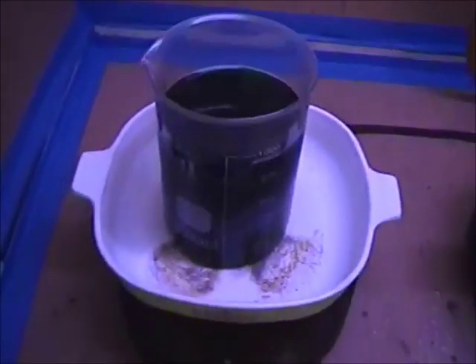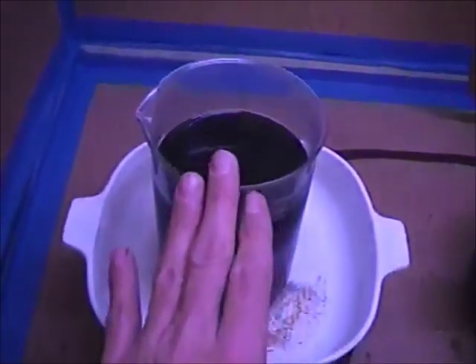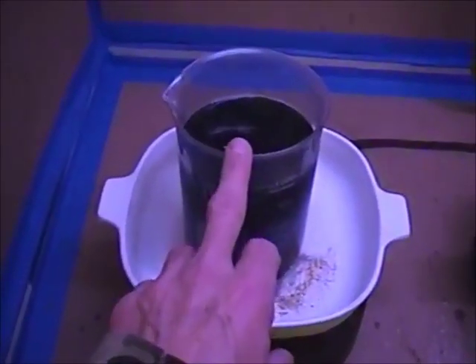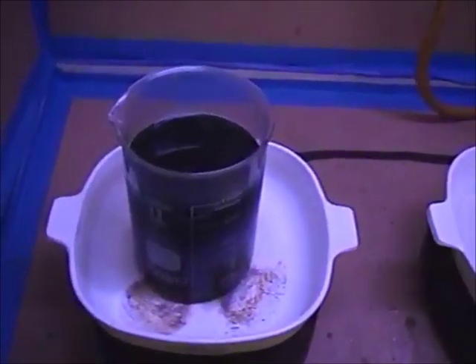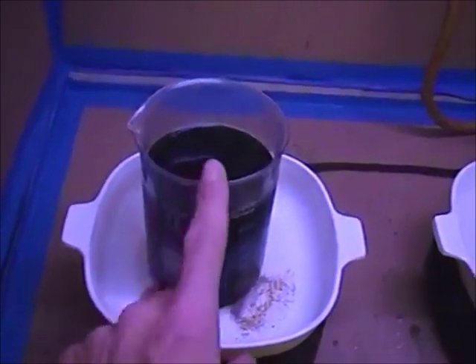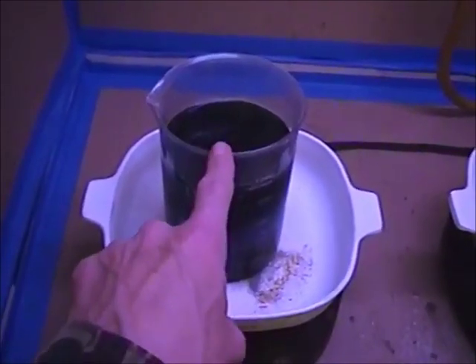I'm not sure what that is, but at this step it's not going to matter, because the next thing we're going to do is add our sodium hydroxide solution to raise the pH. By raising the pH, we're going to precipitate out some of the metals, some of the copper that's in the solution. As those metals fall out as hydroxide, we're going to filter this again before we add our sodium formate to drop our silver.